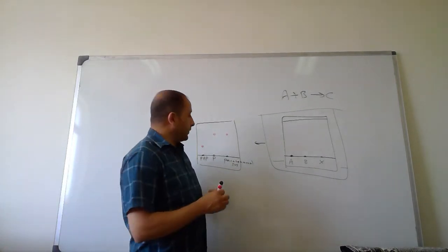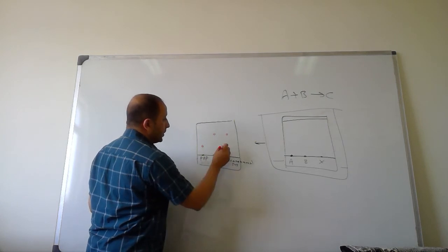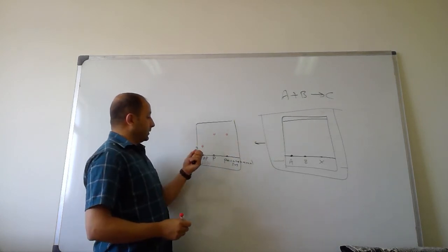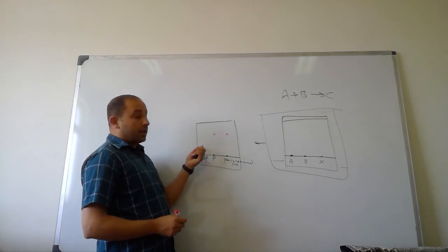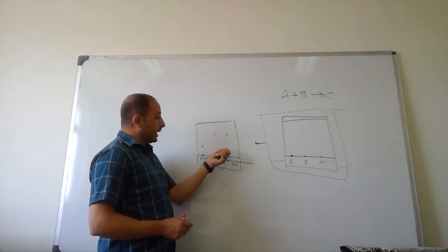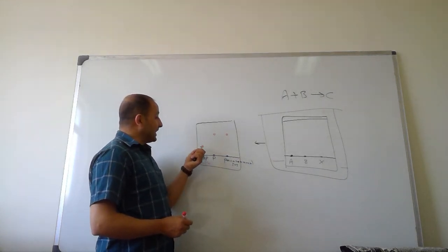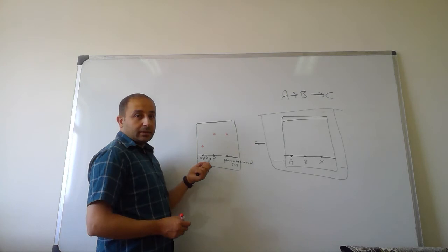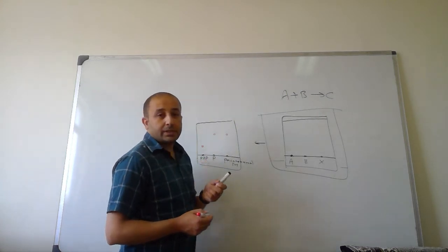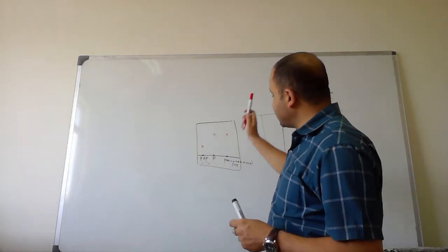The limit test here, assuming we have 0.1%. So this spot is more faint than the spot here. So the byproduct or residual product para-aminophenol doesn't exceed 0.1%, and assuming that 0.1% is the allowable limit, we can pass paracetamol.